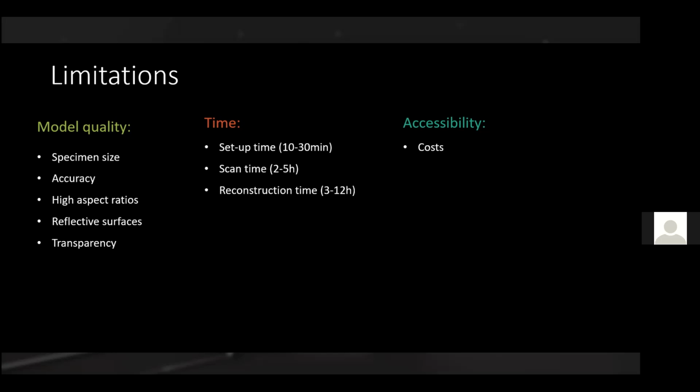And of course, also in terms of accessibility, it still costs some money to make it, right? I think 180 quid is roughly the figure at the moment, but it's still some money. So not everyone has that amount of money. And it still requires some equipment to have access to. And although it's rapid prototyping, and many institutions will have access to a 3D printer and a laser cutter, not all will. So if we really want to make this accessible as broadly as possible, that is something that stands in the way of that.